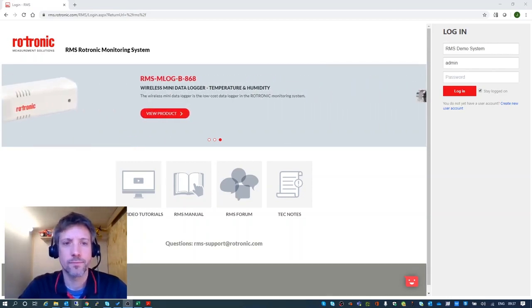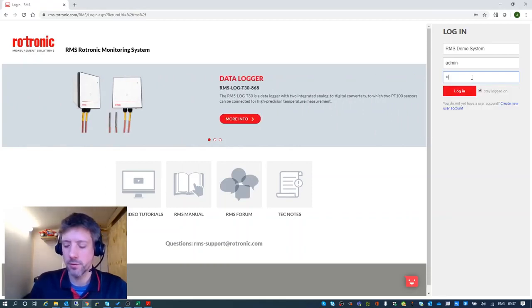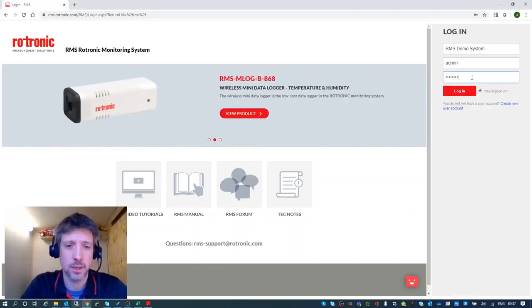Just another short video continuing on our series looking at the Rotronic Monitoring System. And today I'm going to introduce how we set up and create reports in RMS and how you can extract data and get notifications of events and things.